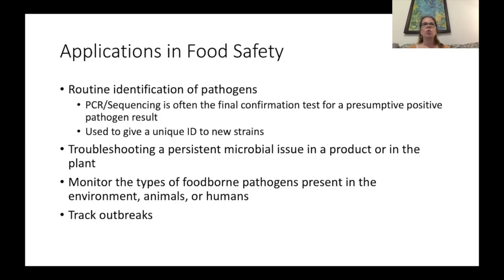Increasingly, we're purifying cultures and sequencing the entire genome of that culture. That allows us to identify unique strains that may fall into a genus or a species category but may differ from other strains.